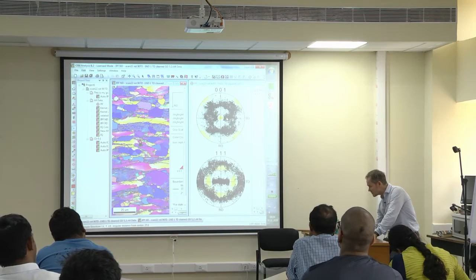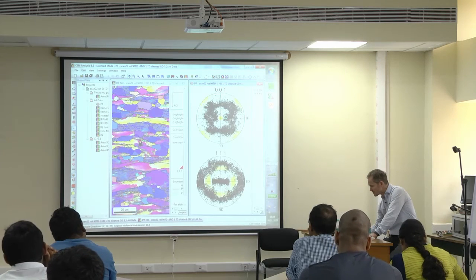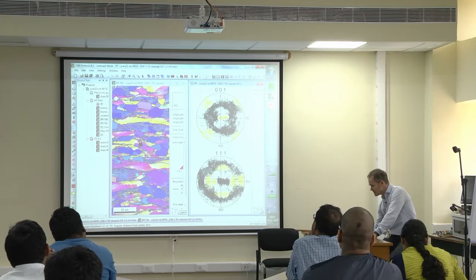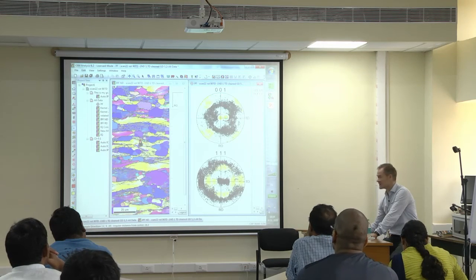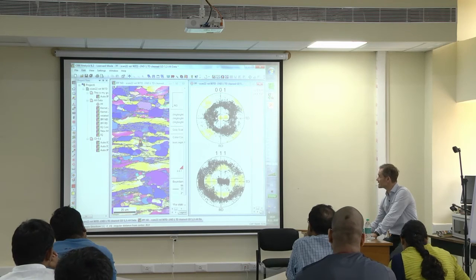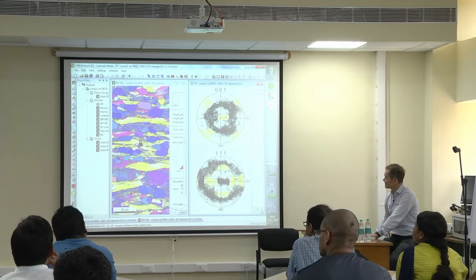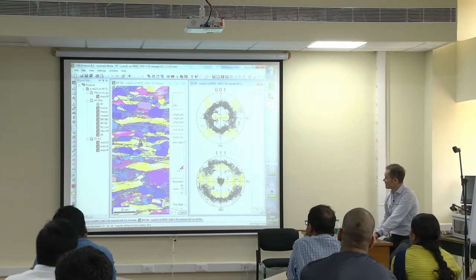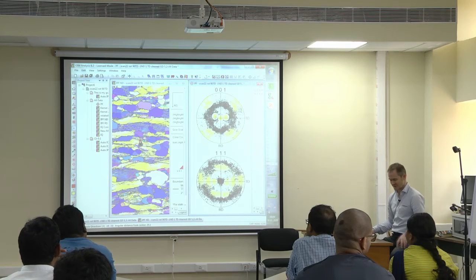that as well. I click here as well, yeah, for selection, right? Okay, now the other half of the pinky grains is coming, and I click here for selection. Okay, and now probably all the other pink grains disappear, yes, and only the blue ones are left over, no?